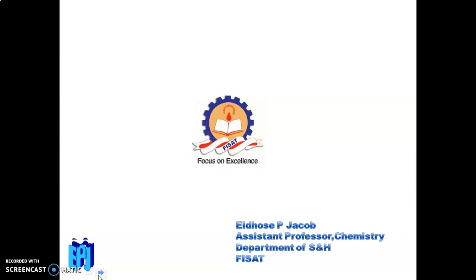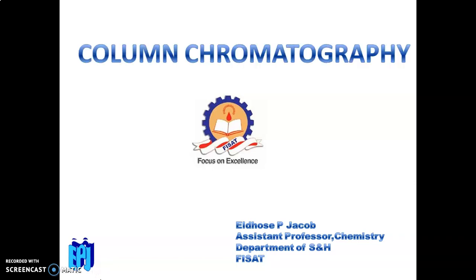Today I'm going to discuss the topic column chromatography. From the name it is clear that this is one of the chromatographic techniques. We know what we mean by chromatography. Chromatography is a technique for the identification, separation and purification of components. So one of the techniques involved in chromatography is column chromatography. So today in this video let us discuss it in detail.